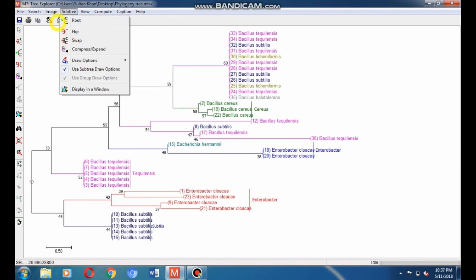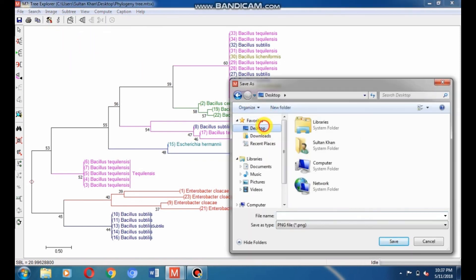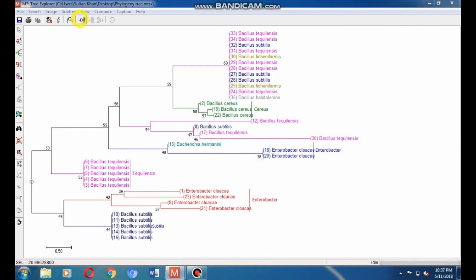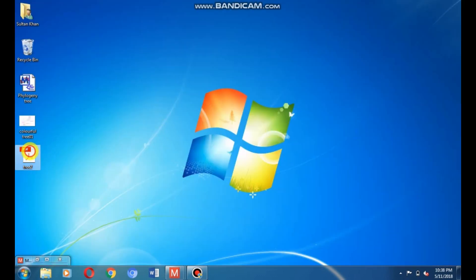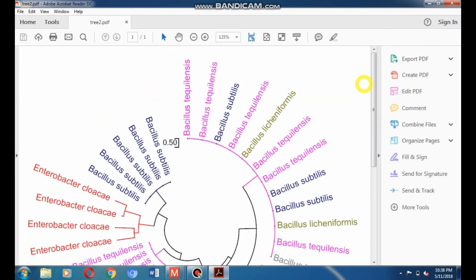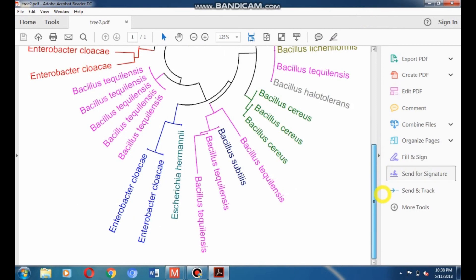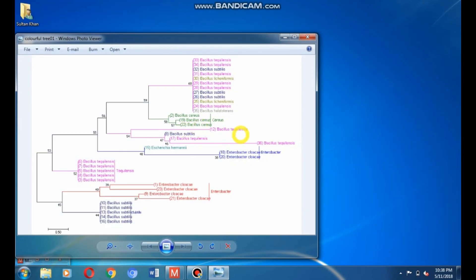Go to Image to save the phylogeny tree in different file formats. Select PNG file to save it in PNG format at your selected destination, such as the desktop. Type a title such as 'colorful tree 1' and click OK to save it. Here you can see your saved files — the PDF file and the PNG file. Open them to see the circular and rectangular phylogeny trees. Thank you.